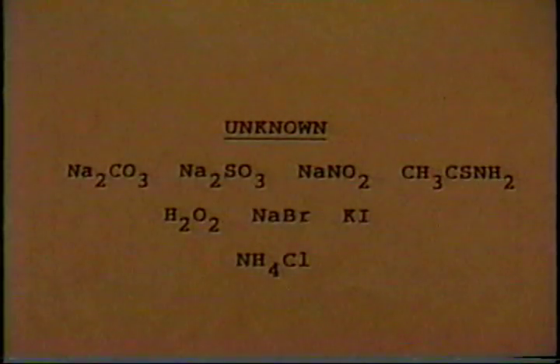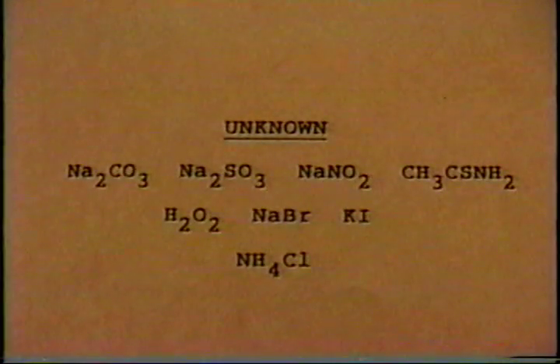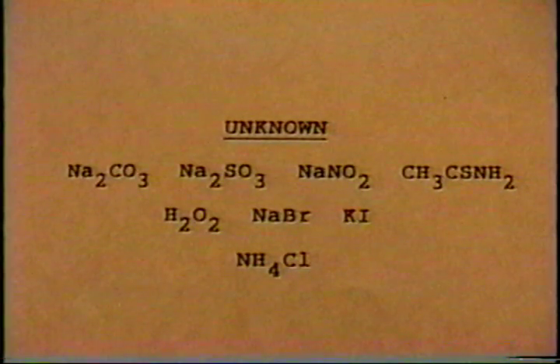Finally, you will identify an unknown. The unknown will be a solution of one of these.